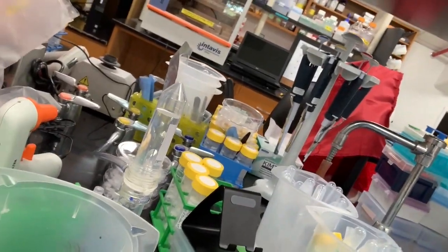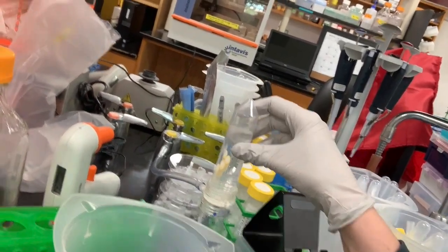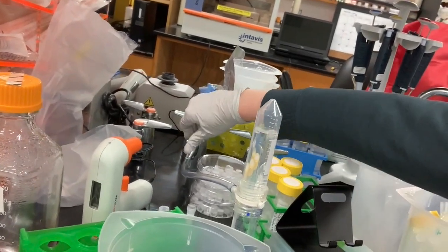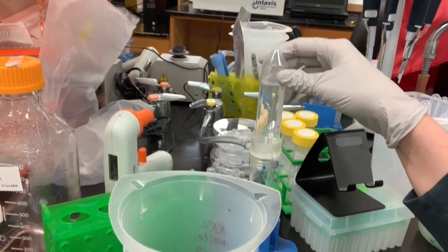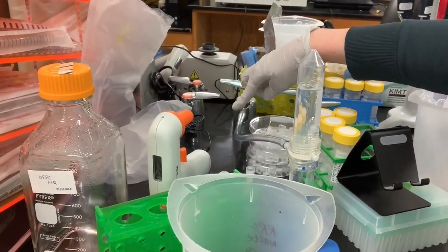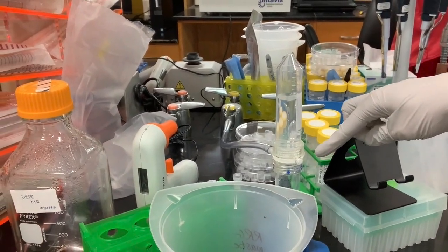So here is my filtration system, and then the vacuum is back here with the tube between it. I'm going to turn on the vacuum, and that will pull my solution through this filter into the tube below. I made a mistake. I didn't get this quite lined up properly. And that will pull the solution down into the bottom tube.